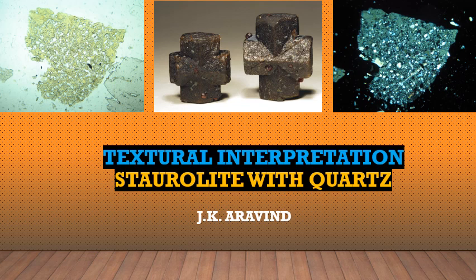It is very common to get quartz inclusions within staurolite. This is very commonly observed in microscopy. Under the microscope, optically, when we view this staurolite mineral, we can observe some quartz inclusions within it. So what does it indicate? Before going to that, we will see how we distinguish this staurolite.